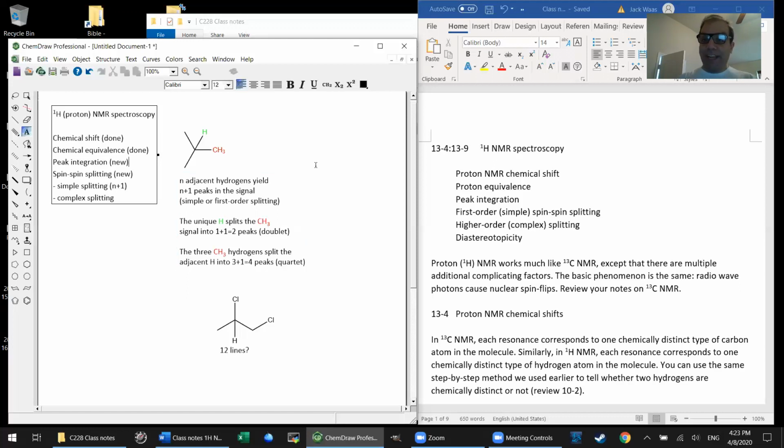So that's why you never got told that in a carbon NMR spectrum. You can get some kind of an idea in a carbon NMR spectrum from the relative heights of the peaks. Yeah, that's true, but it's only rather rough. There's certainly nothing exact about it.